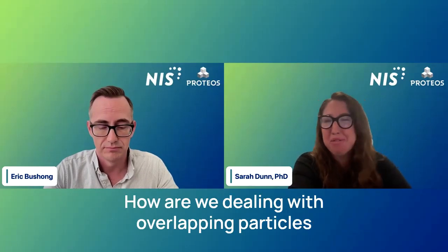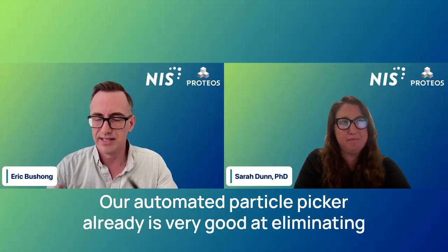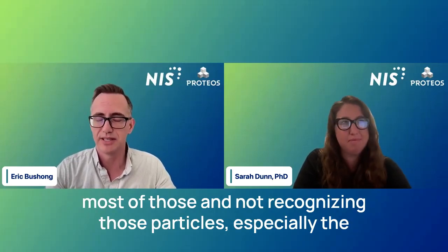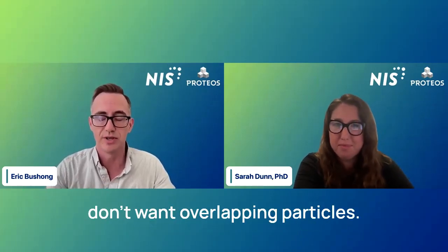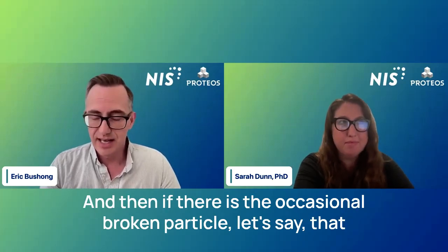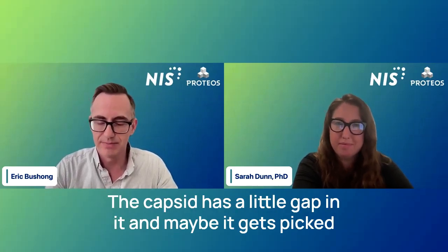I should say, the next question: how are we dealing with overlapping particles or broken particles? Our automated particle picker is already very good at eliminating most of those and not recognizing those particles, especially the overlapping particles, because there's built-in logic to not pick particles that are too close to each other. And if there is the occasional broken particle, let's say it's not quite complete, the capsid has a little gap in it, and maybe it gets picked by the automated picker.